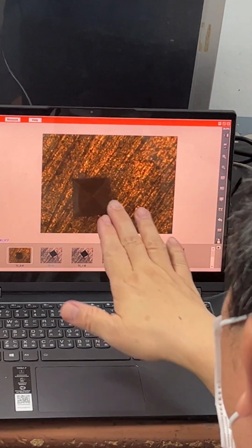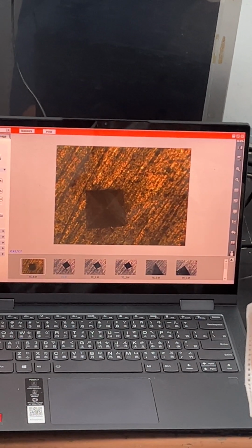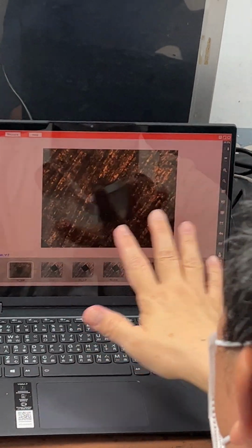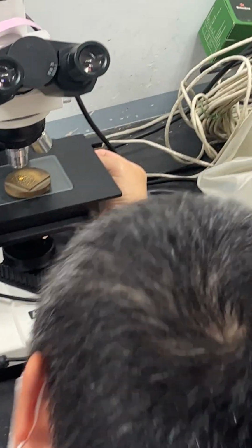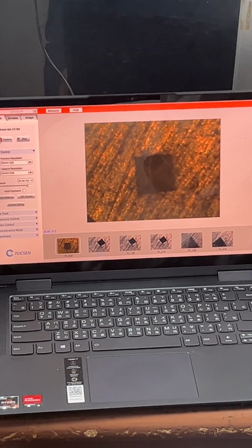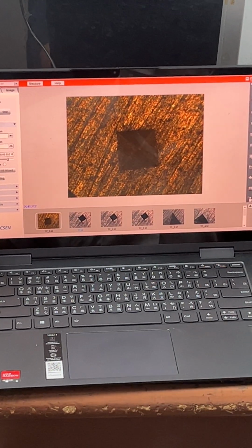It's about the position supposedly, and if I want to see the image clearer, I use the smaller wheel to fine tune the vertical position, and you can see here that you can make it clearer. Fine tuning, for example, this one.